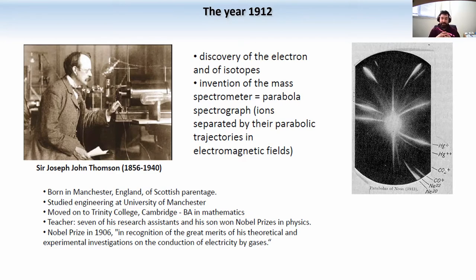But the reason why I show you this slide is because what you see here on the right is the very first mass spectrum that I could find anywhere in literature. This was J.J. Thomson spraying neon into this spectrograph, and basically those lines that you see are spectra that represent the masses of the molecules that are being injected.